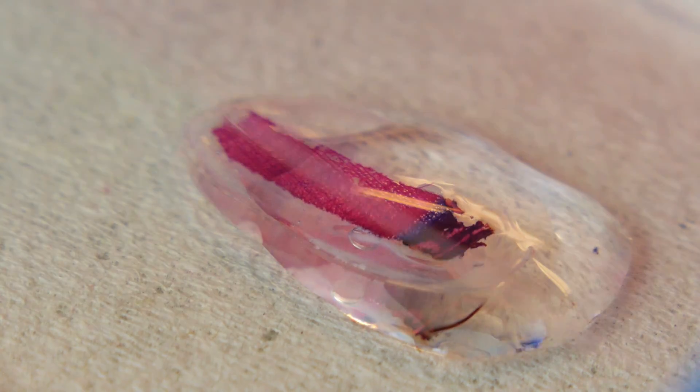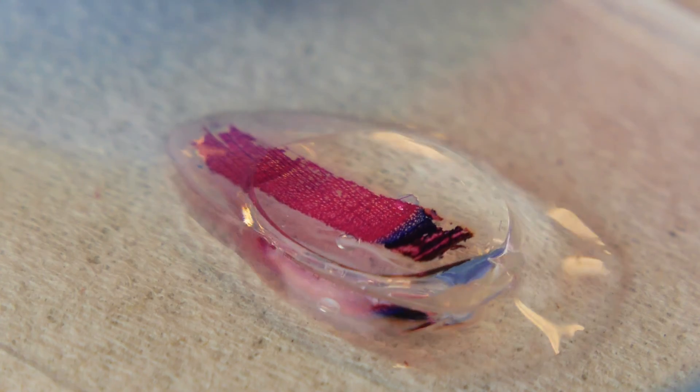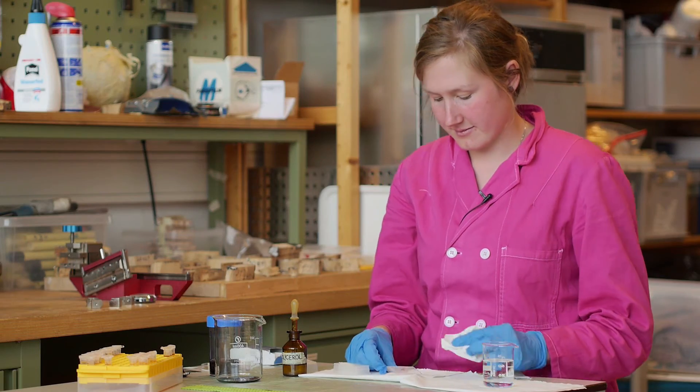Lower the cover glass carefully, beginning on one edge. Clean the object holder from superfluous glycerol. Now your sample is ready.